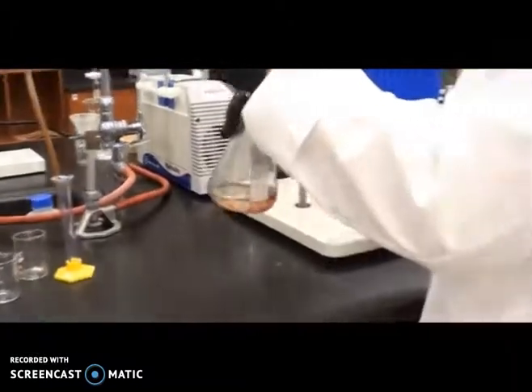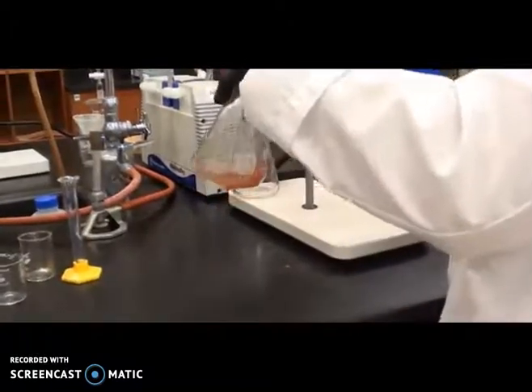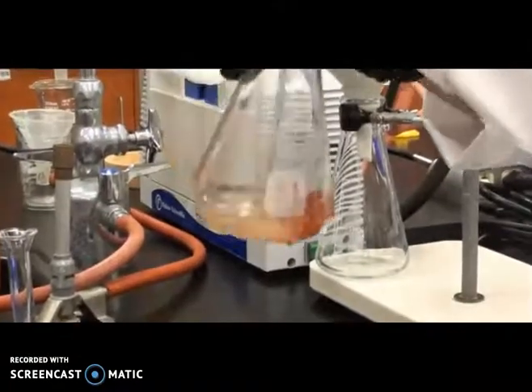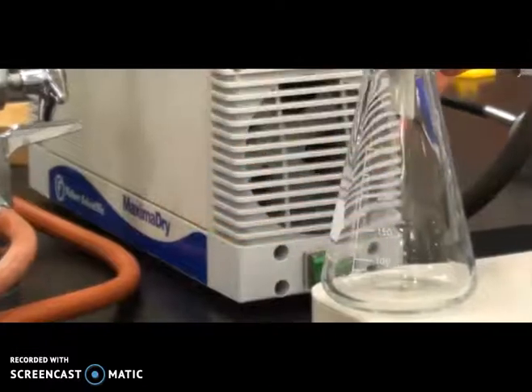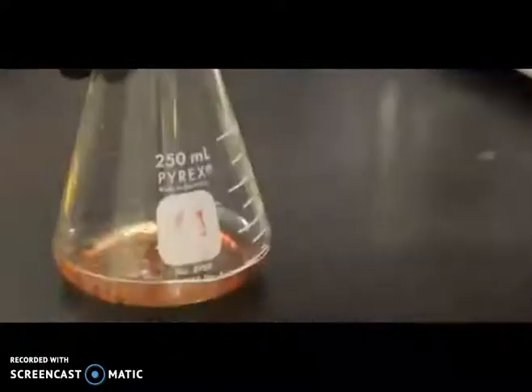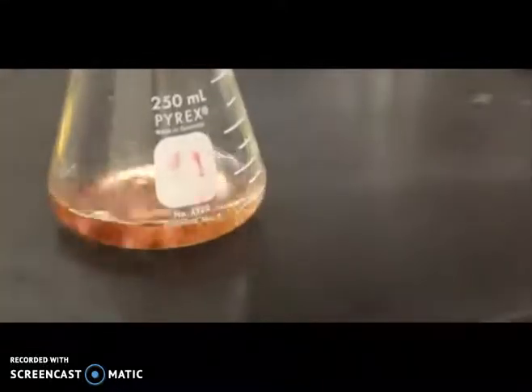Now stirring, you can see how you do the stirring. Now here you have aniline and acetic anhydride. You mix properly.